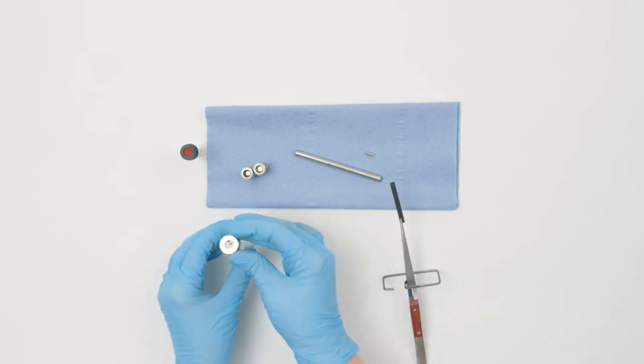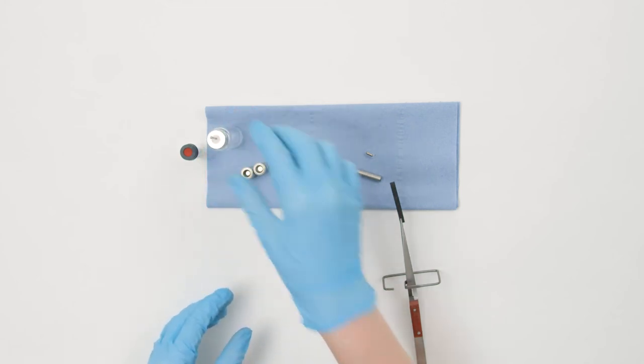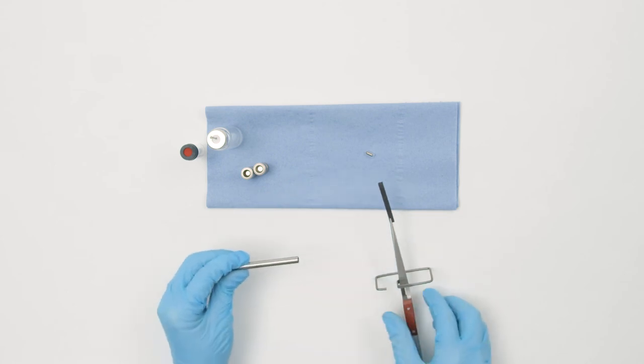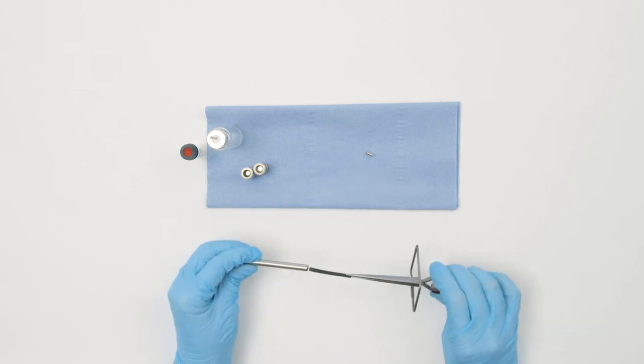In the case of immersive extractions, blot dry the membrane using a dry, lint-free tissue before desorption. Transfer the membrane to a thermal desorption tube, inserting it until it touches the gauze inside.